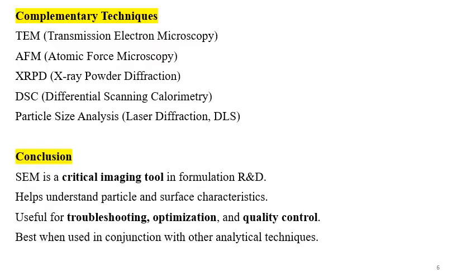What are the complementary techniques for SEM? SEM can be used with TEM, AFM, XRPD, DSC and particle size analysis. Different techniques can be used in combination to have a great understanding.